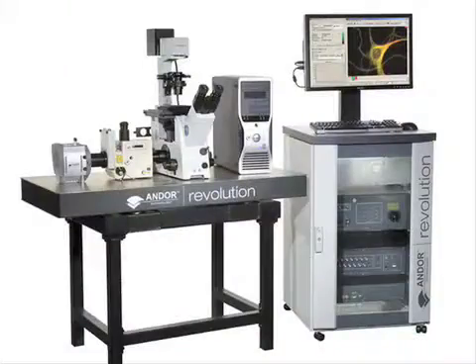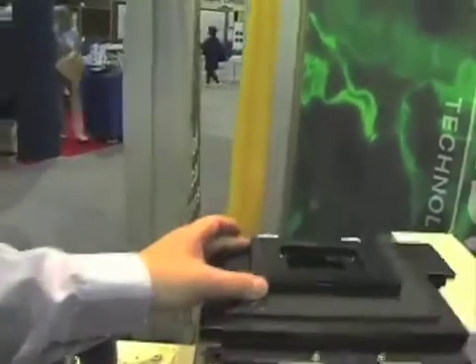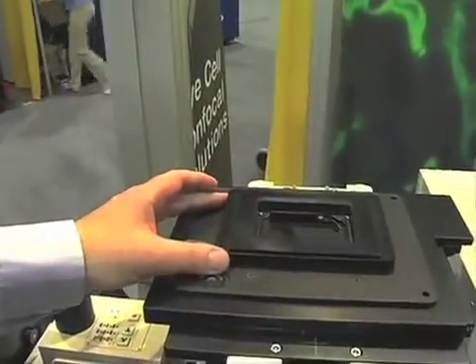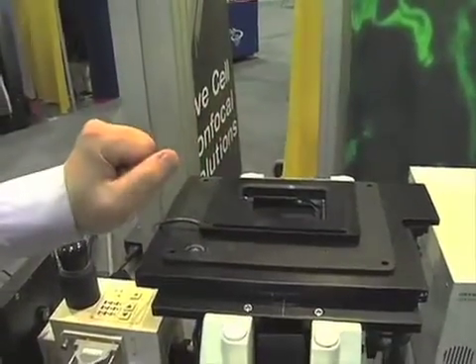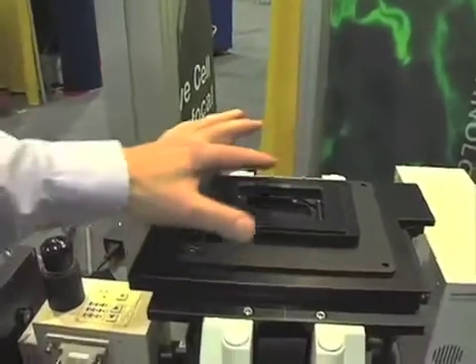It's pretty straightforward in lots of ways if you've been involved in this kind of technology. It's a very compact system, as you can see. Let's start here at the sharp end where the sample is sitting. We've got it currently on an Olympus IX-81 microscope, and we've got no transmitted illumination, but this is simply for convenience for the show. Normally you would have transmitted lights so you could do DIC or phase contrast.